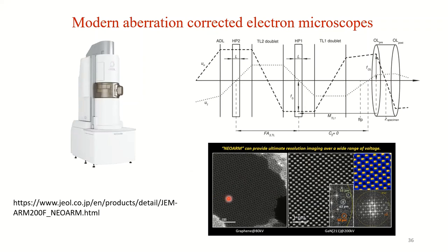And then you have the information limit. Beyond that, you cannot resolve anything. So basically, you have a Young's fringe experiment to see the information limit, but it's not very good to measure the information limit. So people have suggested some more approaches like tilt series beam or Zemlin tableau, etc.